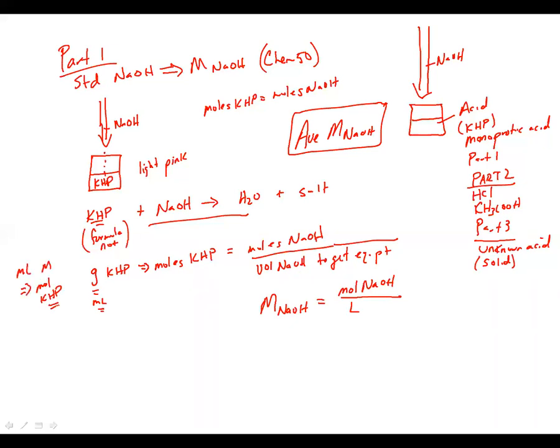It's very similar to the standardization you probably did in Chem 50, where you held all that stuff in that little screw cap bottle in your locker and you had to do the titrations to figure out the actual molarity of your sodium hydroxide. So I believe part one is pretty much that. It's going to be a similar sort of titration.